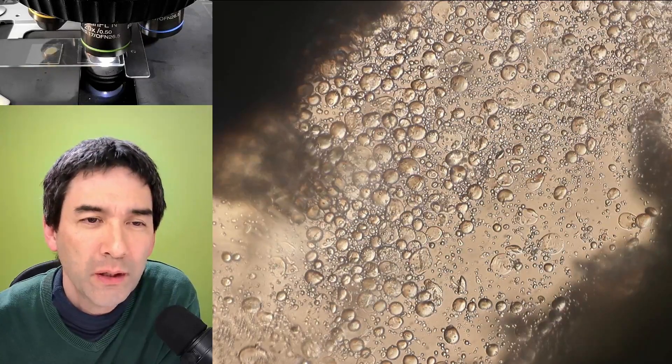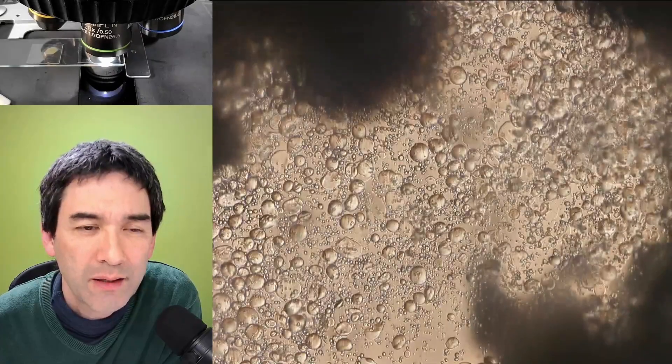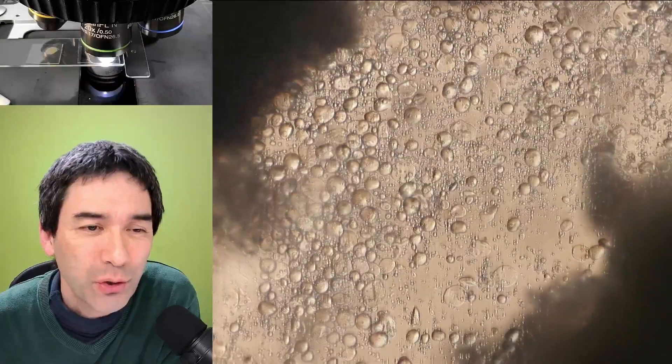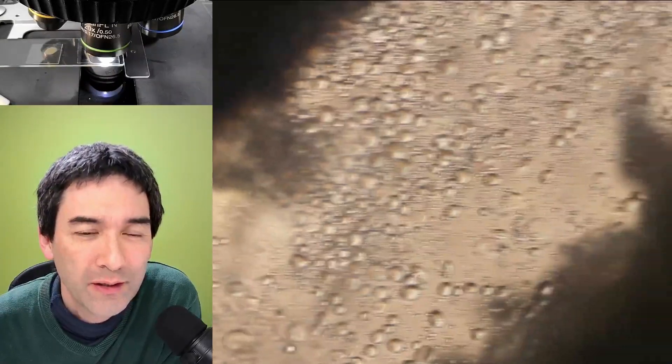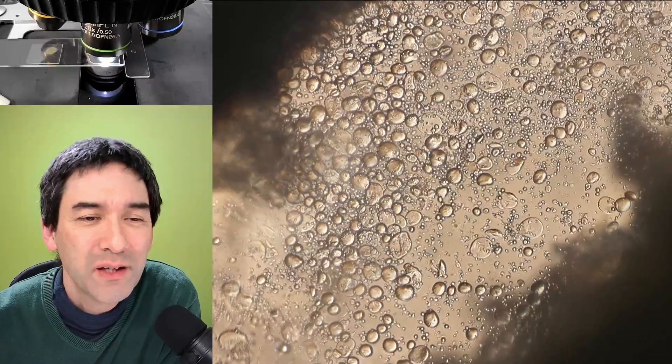Maybe some of them are, but they look very similar to starch grains. Because of course there's a lot of flour in those cookies and those starch grains now seem to have been released into the water here. So quite a nice little specimen that we see here.